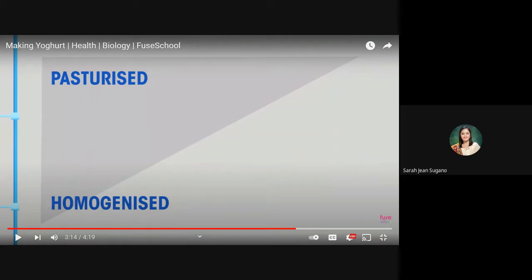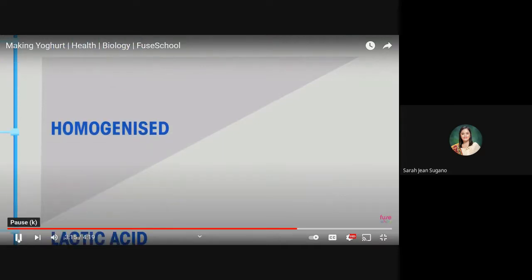So pasteurization takes place for about 30 minutes. You just have to prepare a water bath, and then monitor the temperature at 70 to 75 degrees Celsius. That's the range of the temperature that you have to maintain when you are doing pasteurization in milk. It is not good to go up to 100 degrees Celsius because your milk protein will be denatured and it will cause curdling. So you have to just seldomly stir your milk during pasteurization.